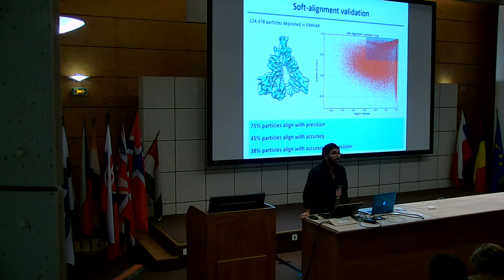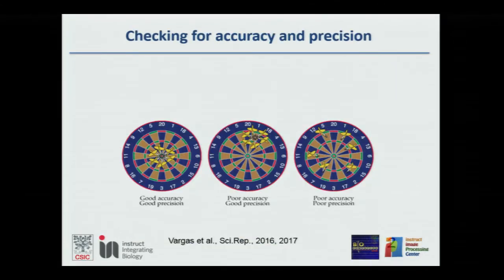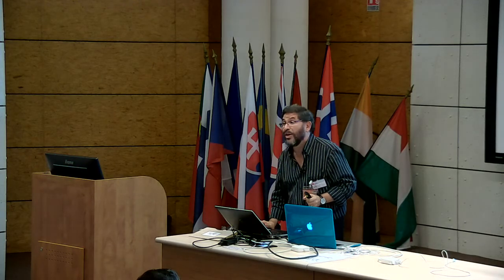So it looks pretty good to me. Yes, it looks very good to you. Fantastic. But it's from your data. It's from the image, right? Let's see. The beautiful thing about local minima is that they are very beautiful. This is a very nice local minimum, but it's totally wrong in terms of going to the global minimum. So this structure is a typical example of a local minimum.